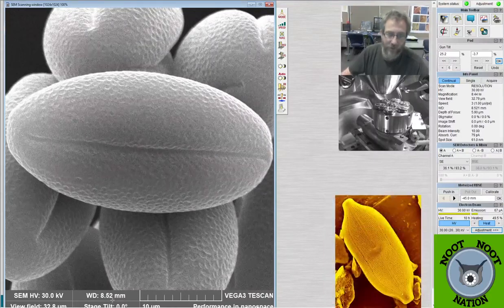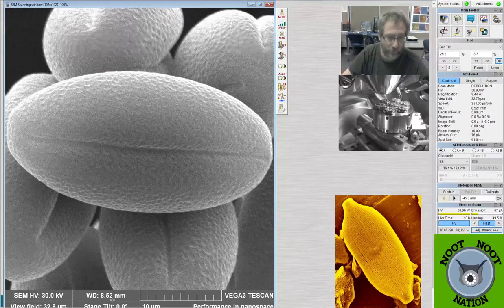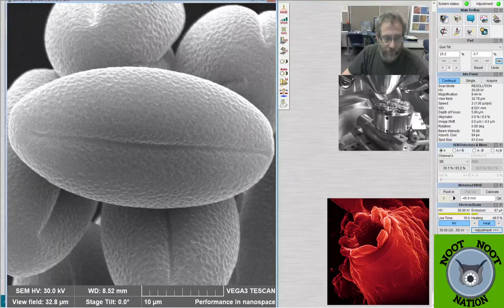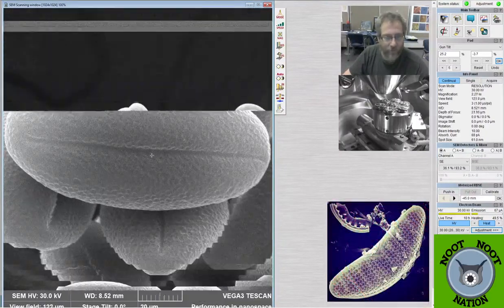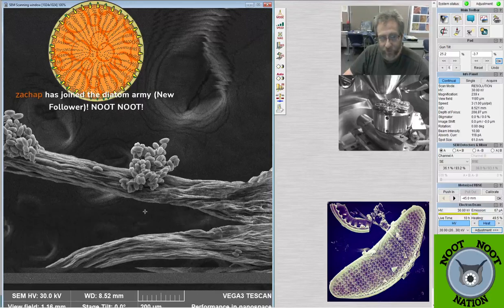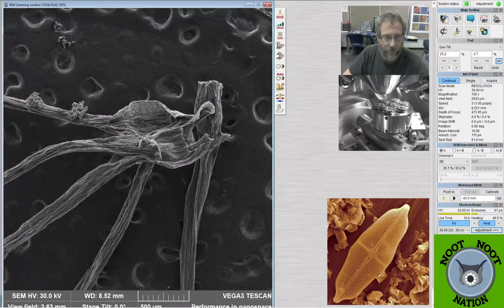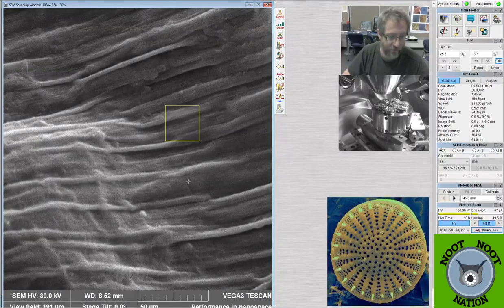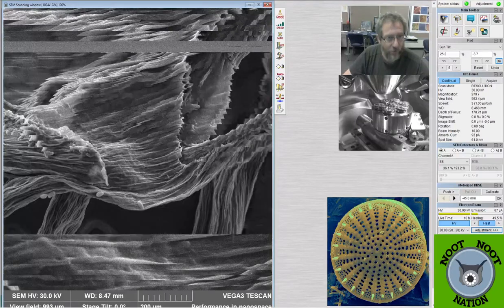This WD is the working distance. That's how far the sample is from the cone, so that I don't smash my sample into the pole piece. And at the bottom of the stage, there's a view field and the accelerating voltage. Right now we're running at 30 kV. I probably don't need it on 30 kV, but out of habit I leave it there from when I look at diatoms and other things where I need to be very close to the samples. I definitely don't need it for this, but I can just leave it there. It doesn't matter much. Having it too high doesn't really do anything except potentially charge the samples up a little bit. But you can see these are the petals themselves, associated with the flower for the redbud.